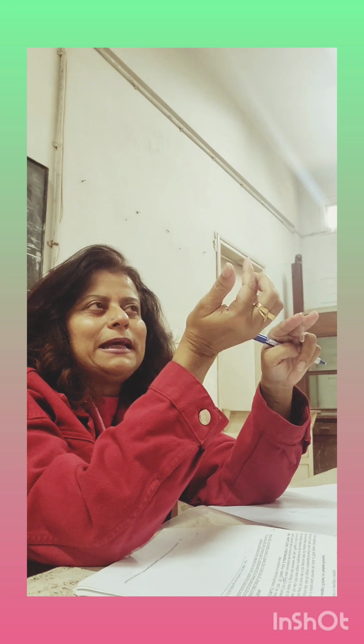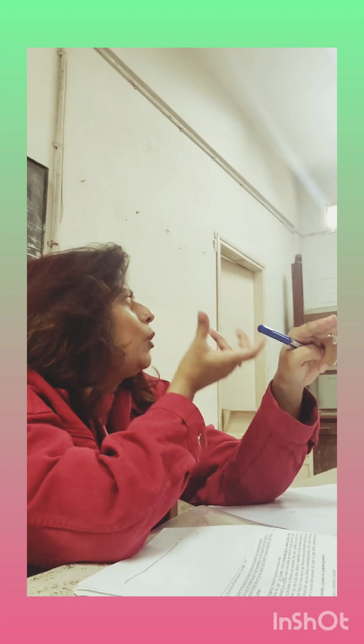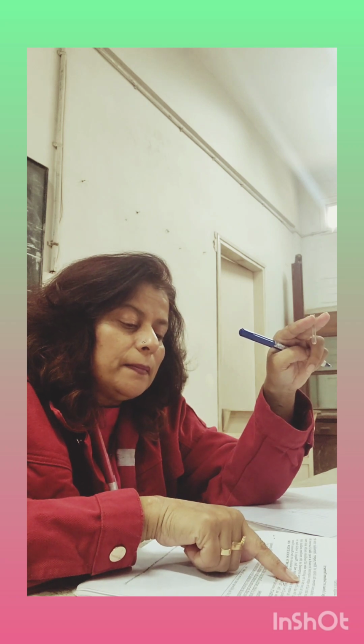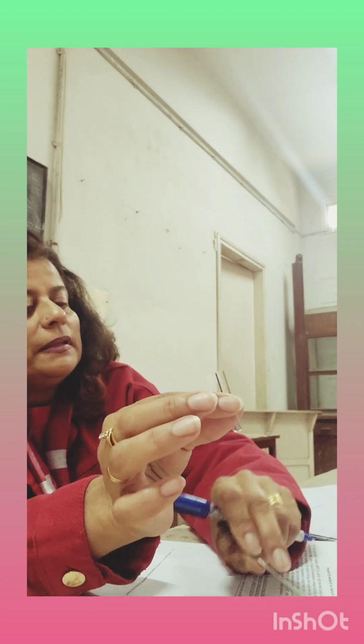So now what happens is that the sodium melts and it transforms into another form. You can see it will present itself like a mercuric bulb for a while, and that state of sodium is called molten sodium. It shines like mercury. So at that stage, yes, now read this line: now add a little more organic compound in the molten sodium. You will take a few granules of the compound again and pour them over that molten sodium. Yes, proceed.